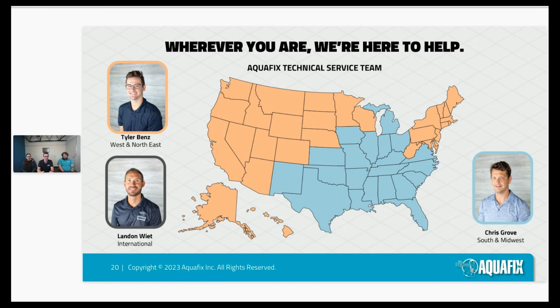Same as said, it's a little off topic, but DO is a big one. Oftentimes we'll get a lot of samples where plants say they have high DO, in the 4 or 5 region, but under the microscope, we see signs of low DO. So somewhere along the lines, there's a low DO issue. Once again, microscopy can help you identify and alleviate issues before they even become a problem. And that's something, if you're interested at all, I'd be more than happy to chat about. Otherwise, kits are available online. We can always send some out as well. Really, whatever works best for everyone.